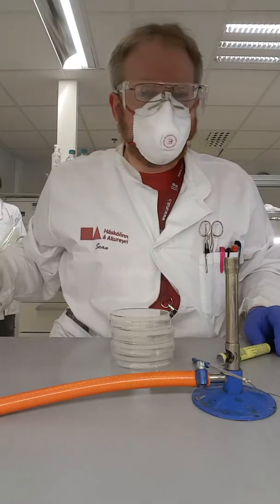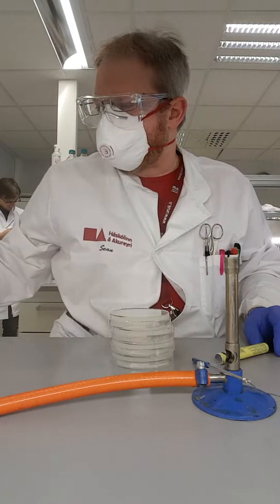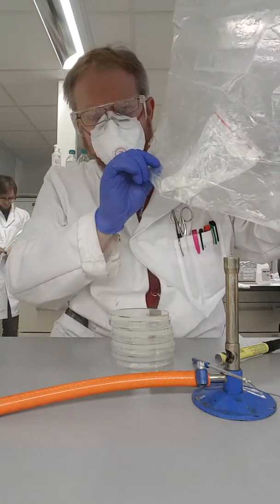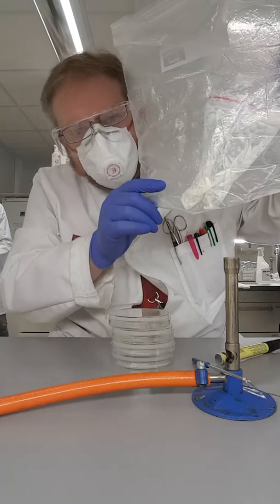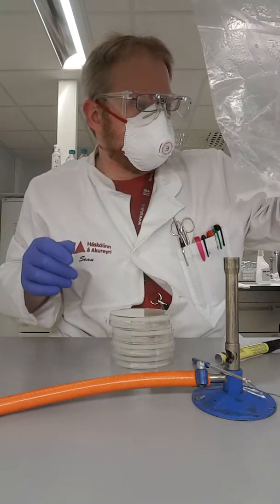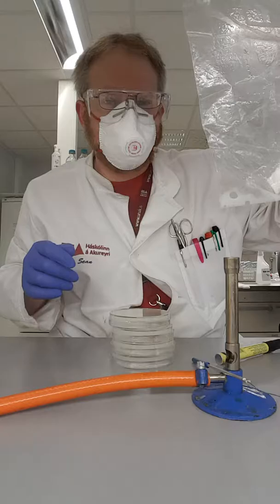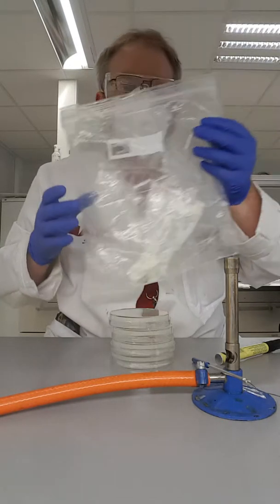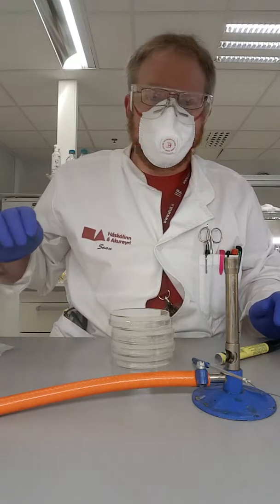Hey Clara, I just wanted to record a quick video for you and show you something. Your mom gave me this sample of — I don't know if you can see that — but it's some sort of soy milk protein thing. And your mom says there should be some interesting fungus in here, like some sort of yeast or something.